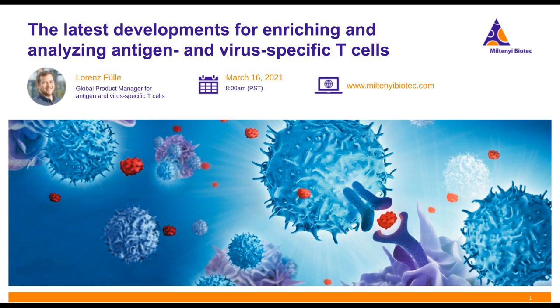However, for the analysis of, for example, one donor sample, we always strongly recommend to have a separate negative and positive control. So basically 3 samples per donor. Which then means that with one kit, you could analyze 33 patients and always have a stimulation, a positive and a negative control per patient.